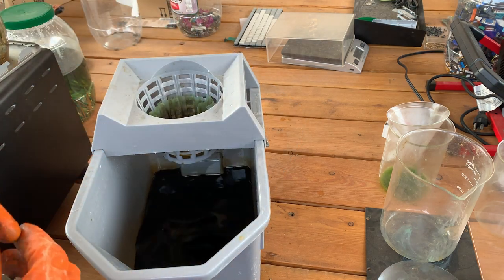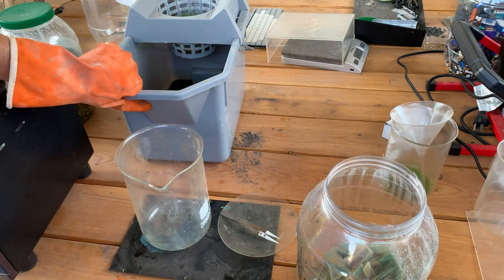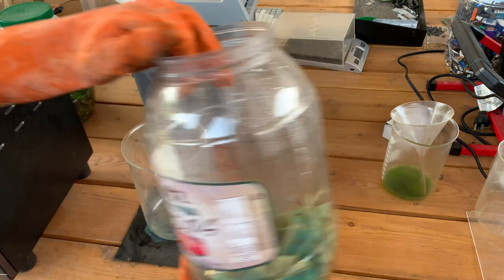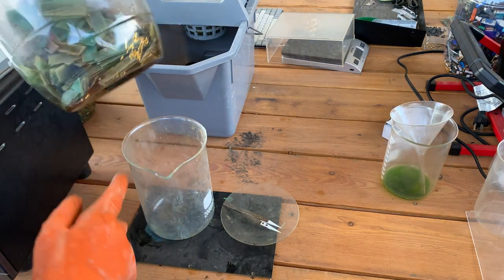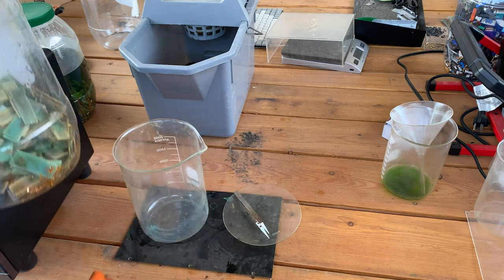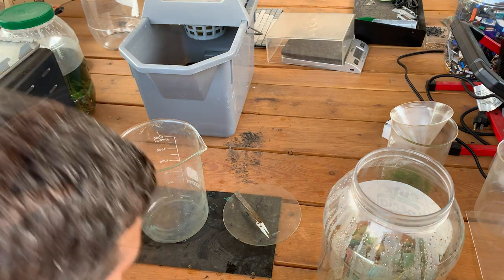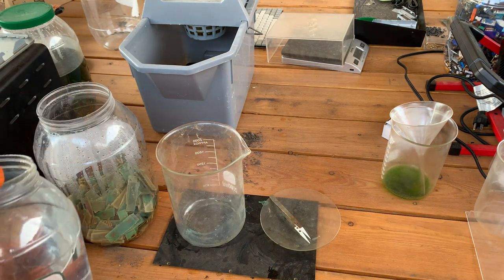I'm trying to collect all this so I can save it. We're going to set the filtering solution off to the side and start putting these green fiber boards and the gold fingers down into this 2000 milliliter beaker. This one I don't care if it gets diluted — I'm going to rinse these off. Let's go ahead and pour some water in here and get the rest of these out.